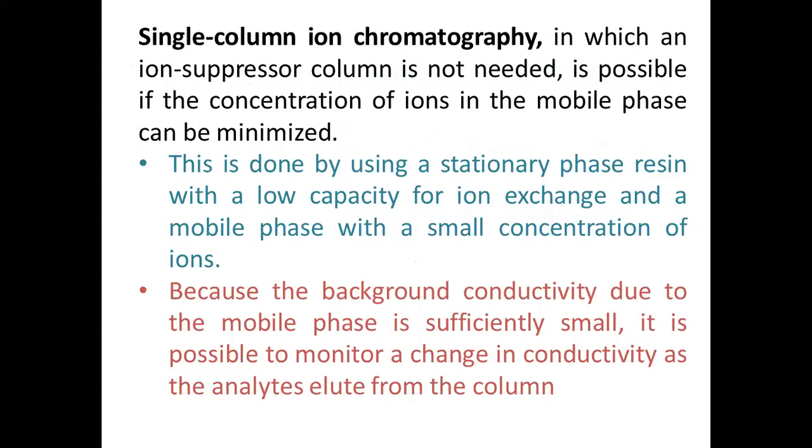We can eliminate the problem. It is very simple. If we intend to use the second column, we will not bother about the concentration of the mobile phase. Whether you use 0.1 molar hydrochloric acid or 1 molar hydrochloric acid, anyway, we are going to suppress the electrical conductivity of that hydrochloric acid, and even sodium sulfate, sodium chloride, sodium nitrate, sodium carbonate, whatever it is, we can suppress the electrical conductivity.